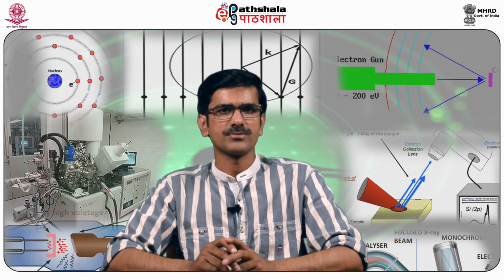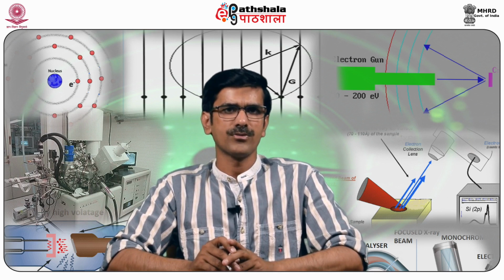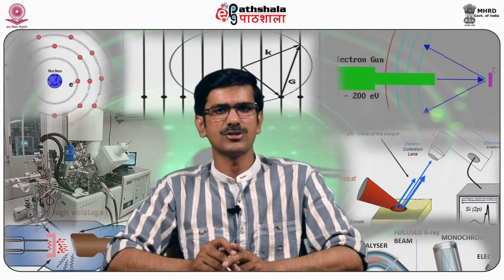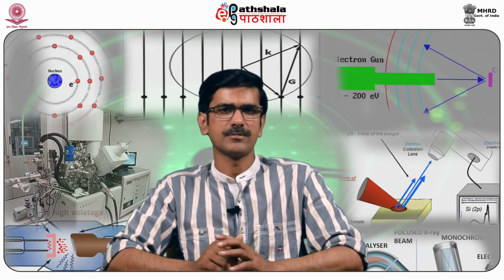Target sample. In principle, any solid or gas sample can be studied by electron spectroscopy. However, liquids require very special techniques. In the case of solids, the source volume as well as the analyzer is kept at lower pressure. Gas samples can be studied by maintaining the source volume at moderate pressure with the help of differential pumping.